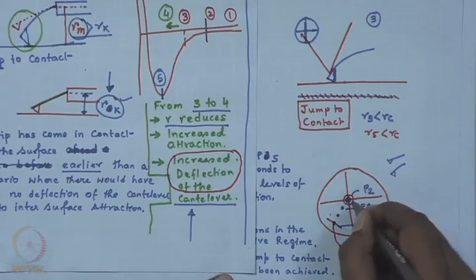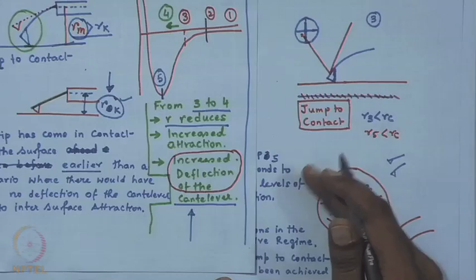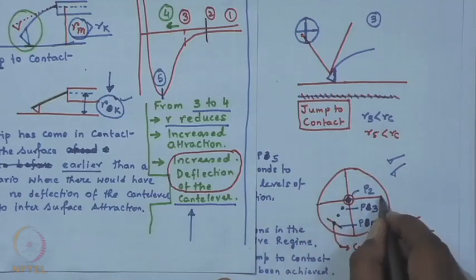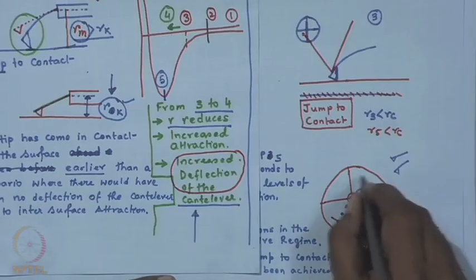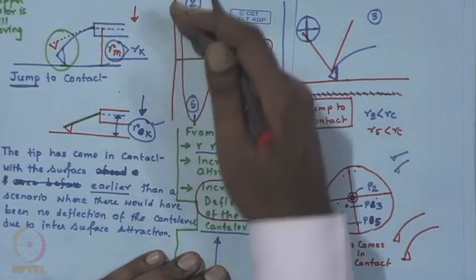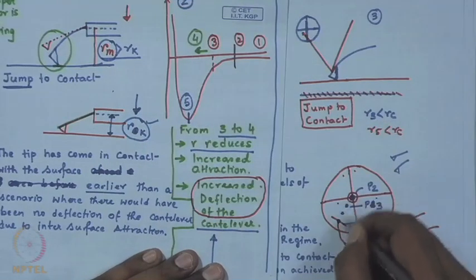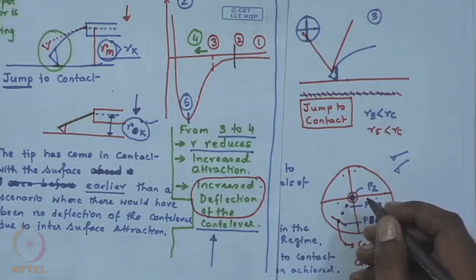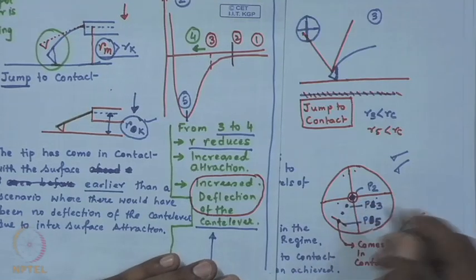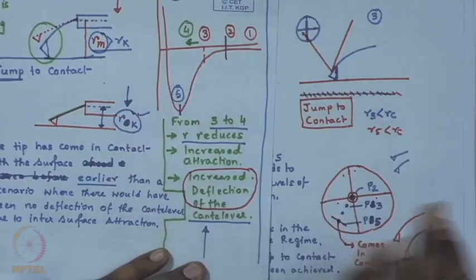Okay. We have drawn, please do not get confused that it has to move in this direction, but we have drawn it just to explain the things to you. It is a QPD, so it is similar to a graph paper. This is the first quadrant, second, third and fourth. We argue that this is the attractive regime or the negative force. So, we are in the sort of negative side. It is nothing really hard and fast that it has to move in this direction. One can always argue it has moved in this direction due to the attraction or any direction. Only thing is you need to keep the force curve in your mind.